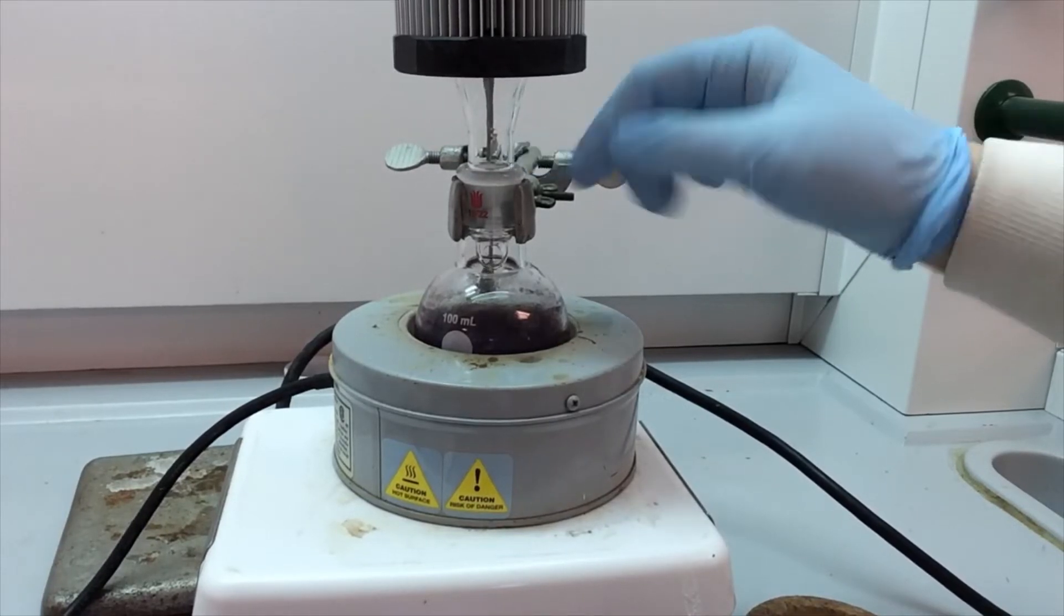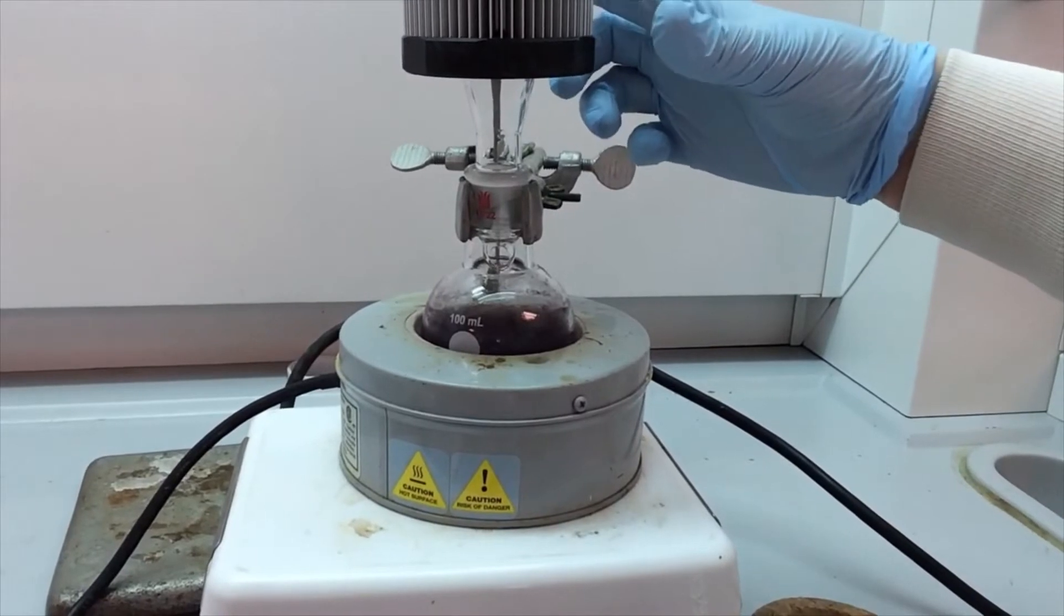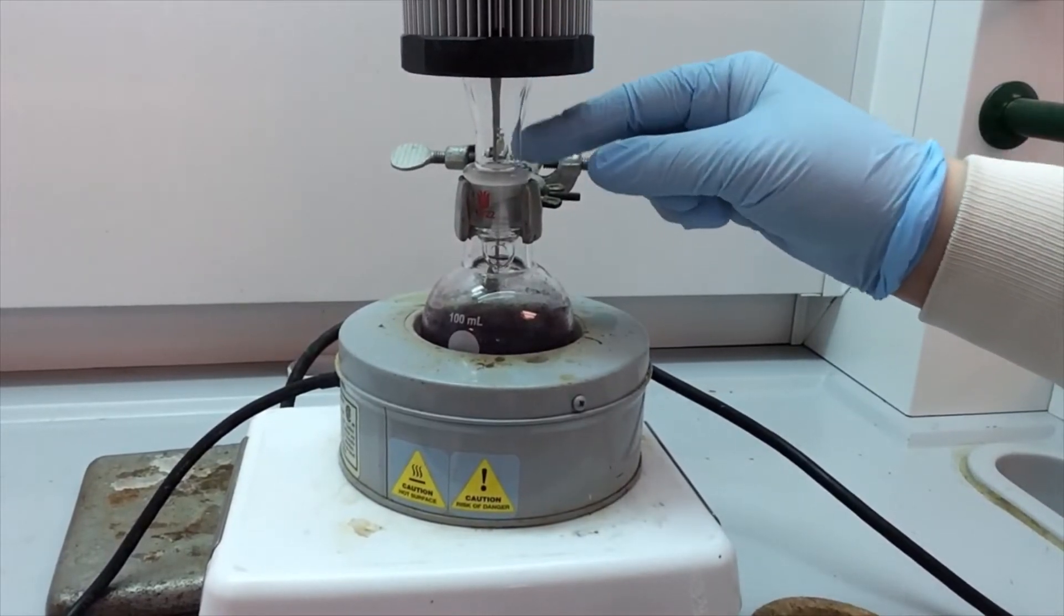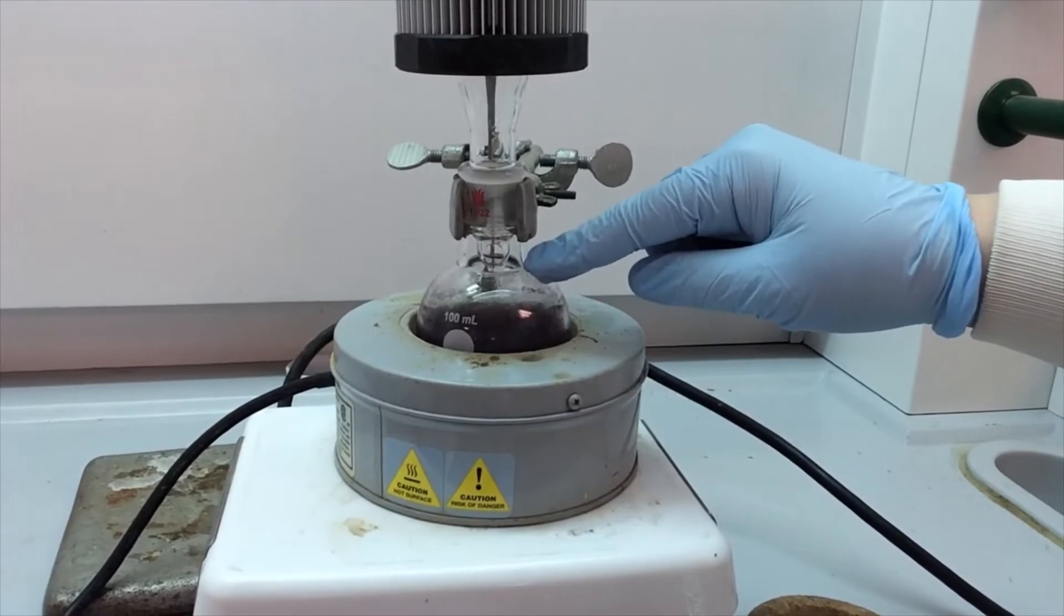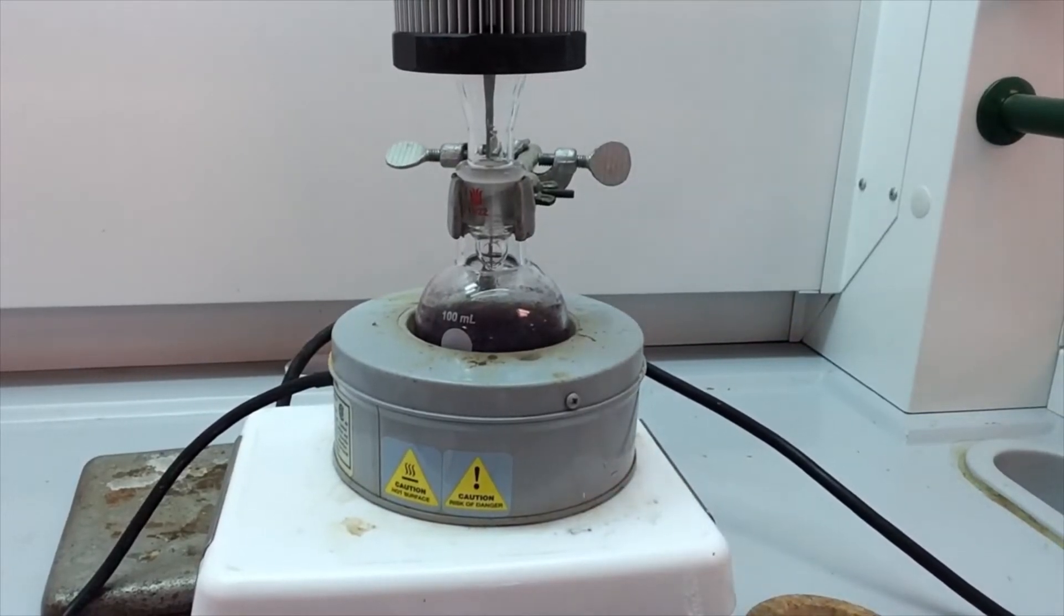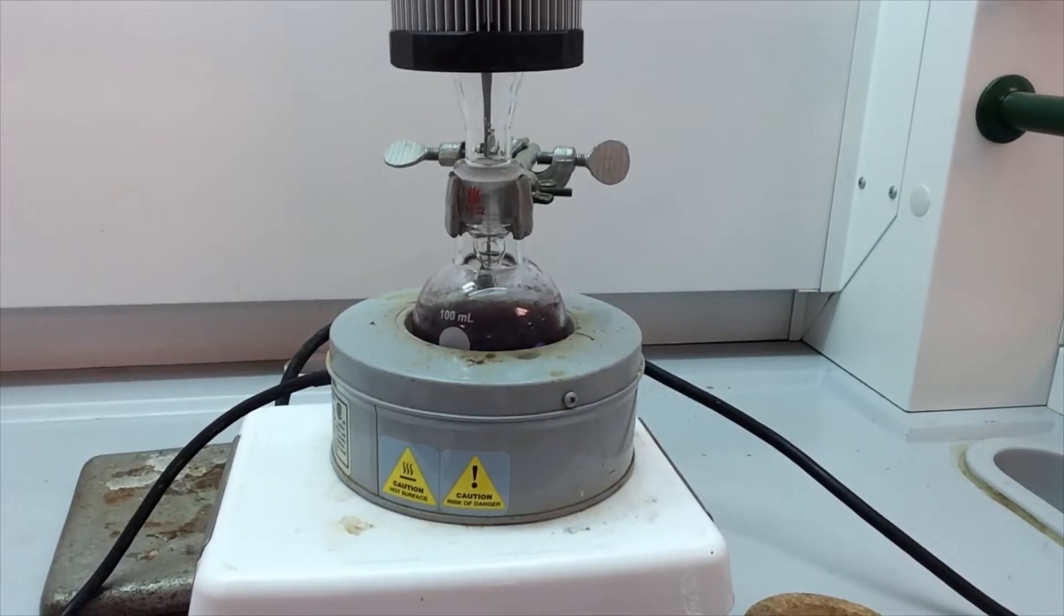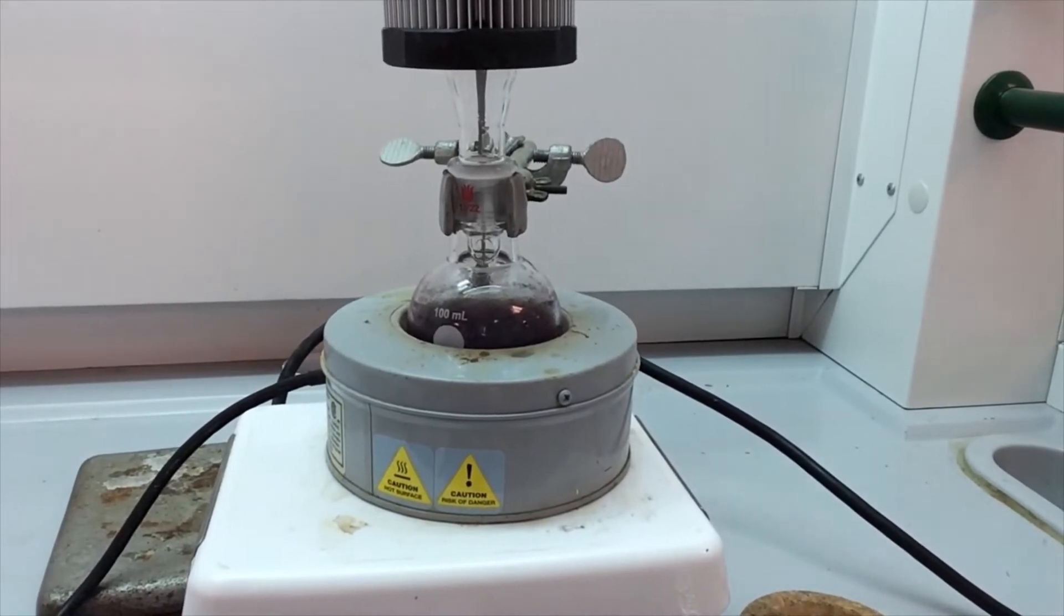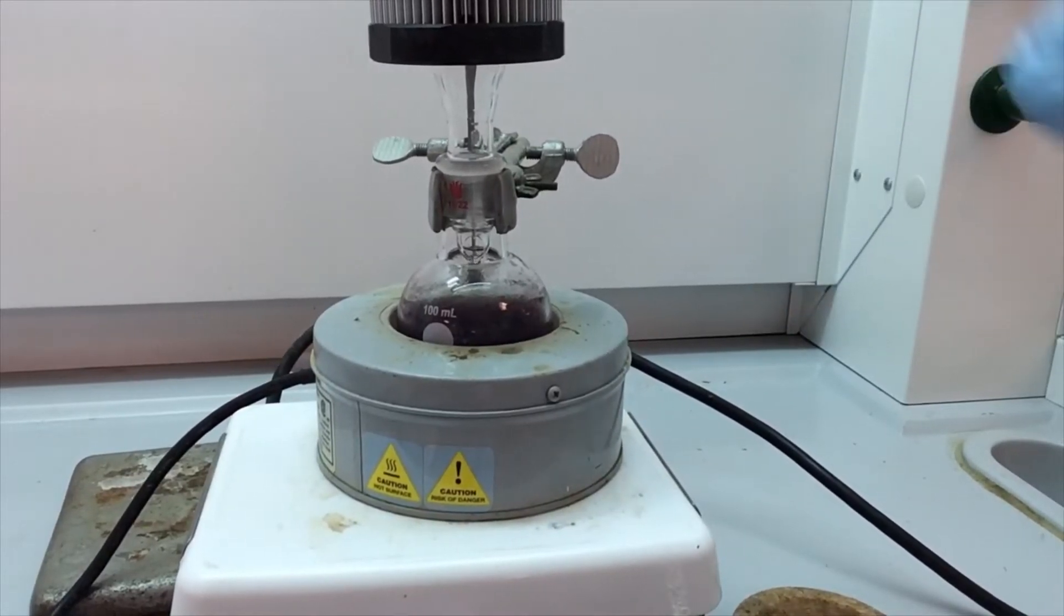So that hot solvent is going up into our condenser here. And then it is recondensing into a liquid and dripping back down. So this is a pretty good reflux rate. Once you see that dripping, that's when you start your reflux period. So if I needed to reflux 30 minutes, this is my starting time point.